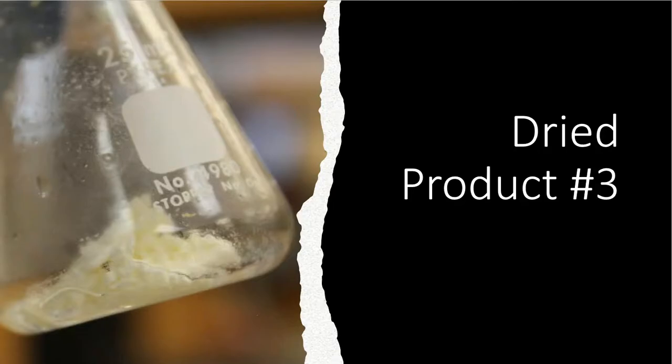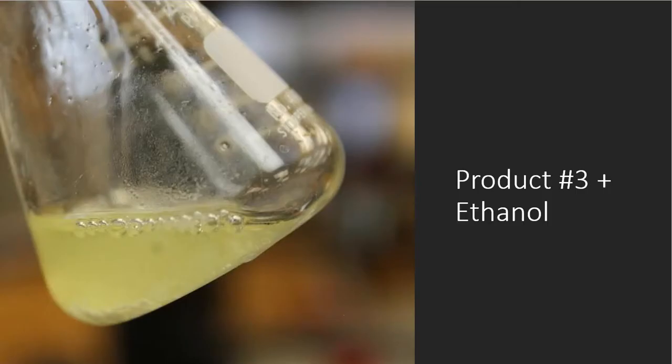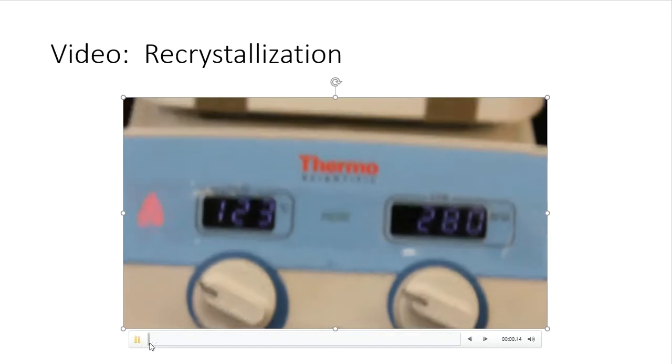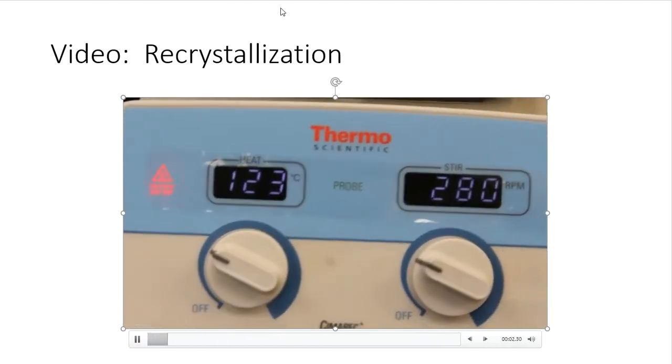So then I go back and I get product number 3. There's what product number 3 looks like. I'm going to add some ethanol to it, and this is what happens. All 3 behave differently with the ethanol additive. This still did not fully dissolve, though. Again, I cannot recrystallize unless I fully dissolve.